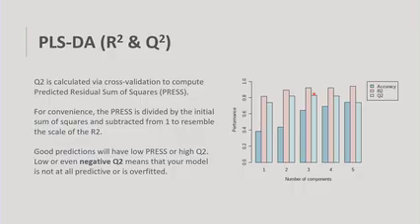There are 3 different metrics: accuracy, R-squared, which you should be familiar with, and then Q-squared, which is a transformation of some accuracy statistics to make them resemble R-squared. This is an example of one that worked pretty well. So you want your Q-squared, that light blue, to be pretty similar to the R-squared, in the pink. As long as that's happening, you can be sure that the separation that you observed in your data is probably robust. It's quite common to see that Q-squared very close to 0 or even negative values. If you see that, it means that you should not put that picture on your poster or in your manuscript because it is not real.